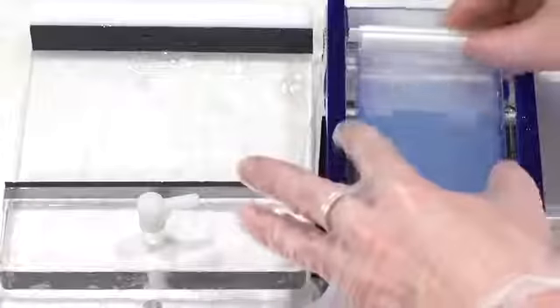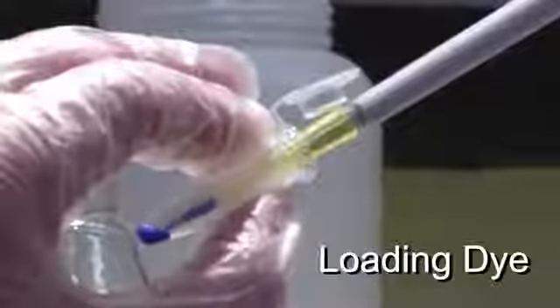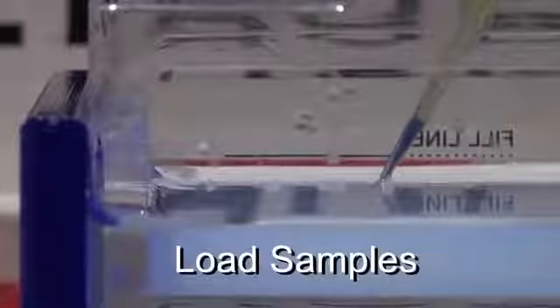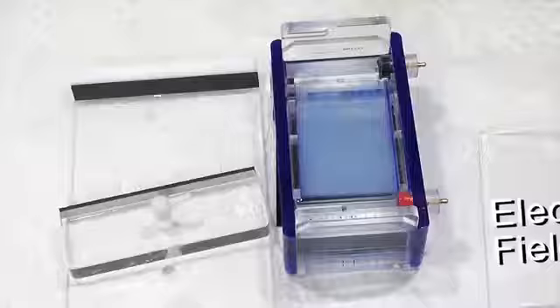Once our gel is set, we just put it into the gel tank. The tank contains a buffer solution which is hooked up to positive and negative electrodes. After we take out the well combs, each sample is mixed with a loading dye. We then load our plasmid sample and insert sample into 2 different wells of the gel. We also load a standard ladder containing DNA fragments of known sizes, and then finally apply the electric field.